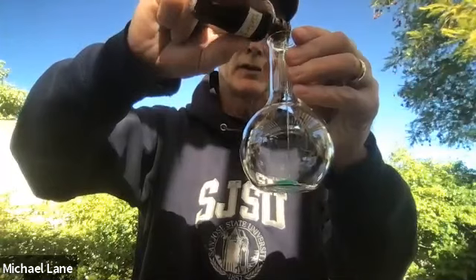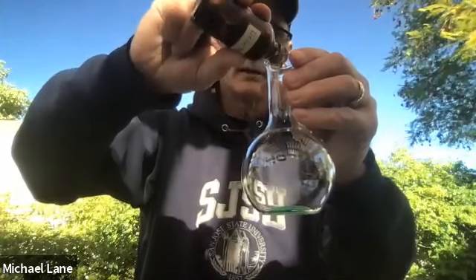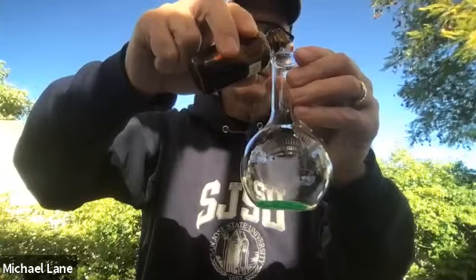I am going to react this in a moment, but there are a couple of things that I want to do. Here's the container that I'm going to put it in. In a minute, you're going to see why. I'm going to put a little bit of detergent in here. This is just some dishwashing detergent. A little bit more is not going to hurt matters. So I've got a little bit of detergent in there. And we know, amongst other things, that detergent makes suds.